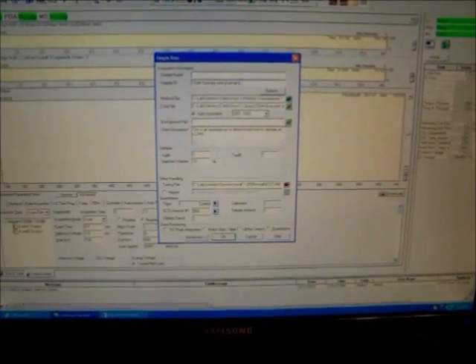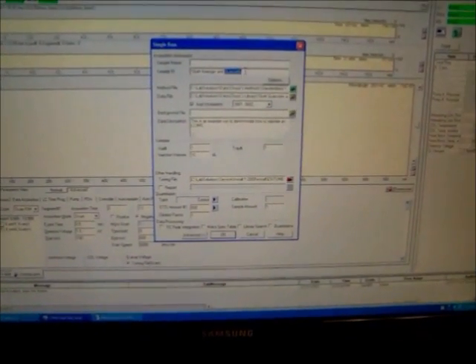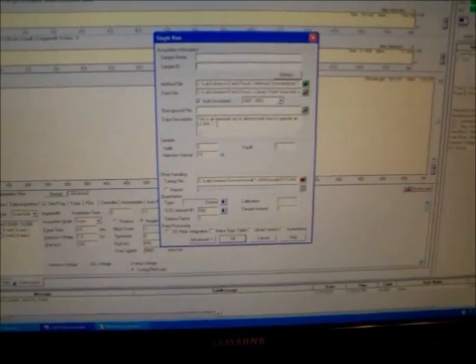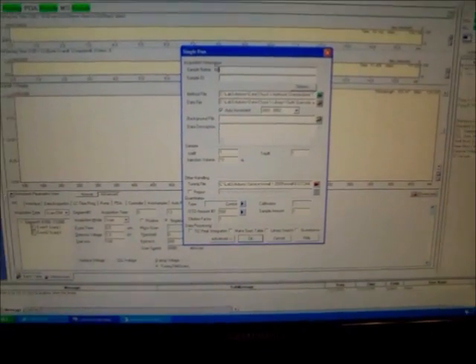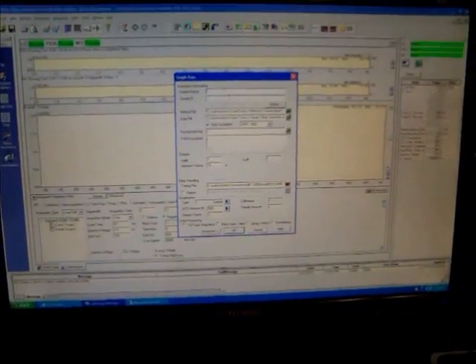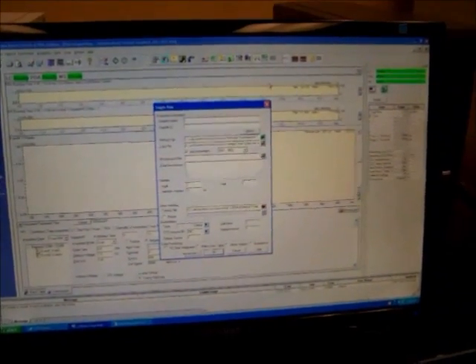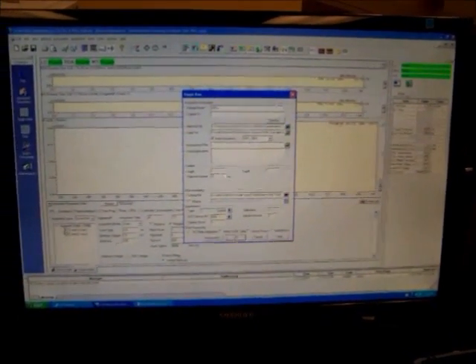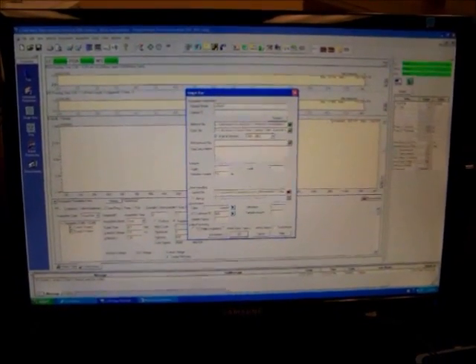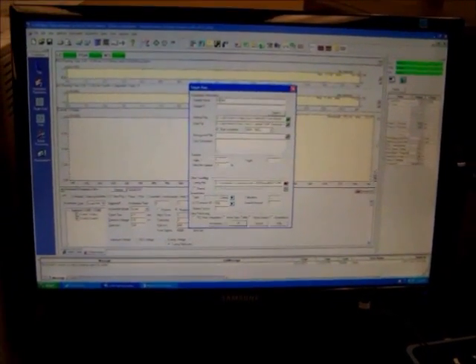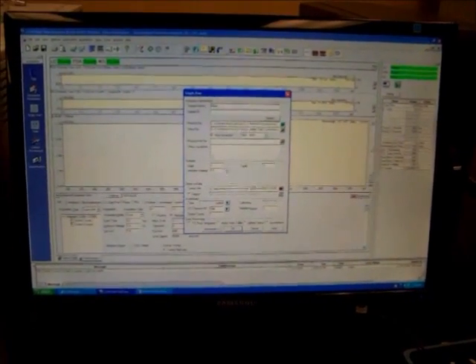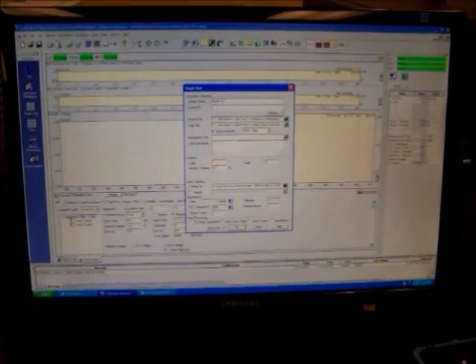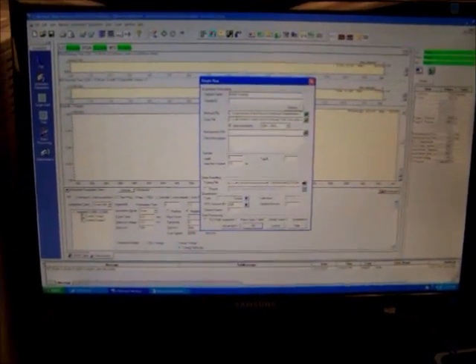Clear information from previous runs. Select our sample. Our sample name is 60 micromolar, 60 micromolars of Naringin.